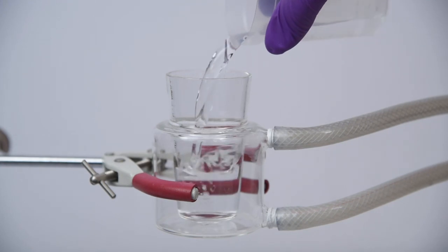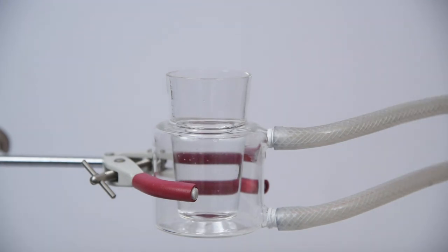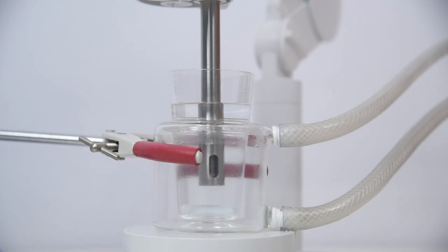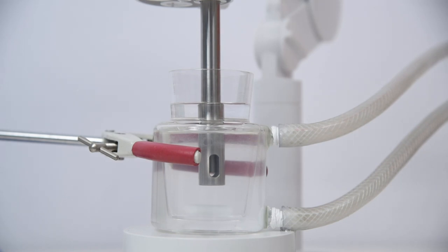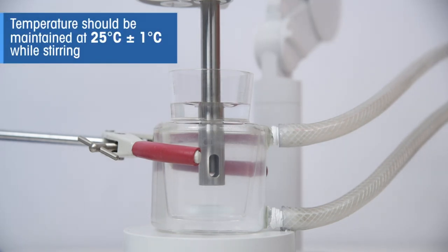For stage two, transfer a sufficient amount of the water sample in a suitable container, such as a thermostatic beaker, that helps in maintaining constant temperature of water sample. Maintain the temperature at 25 degrees Celsius, plus or minus 1 degrees Celsius, while stirring to obtain carbon dioxide equilibrium. We recommend to use a thermostat to do so.